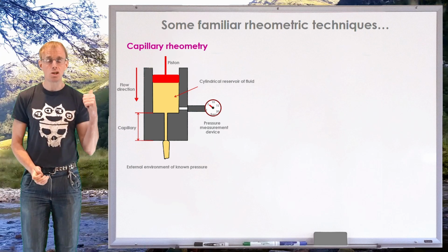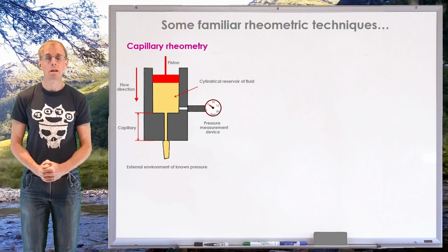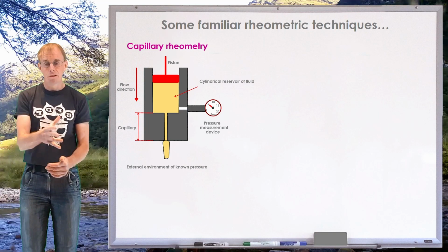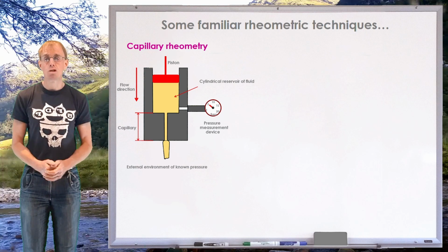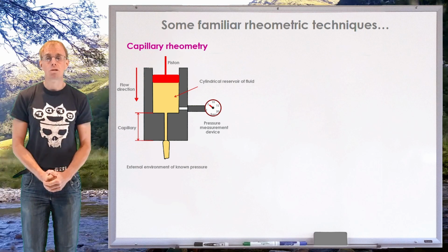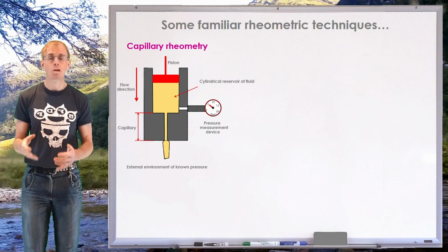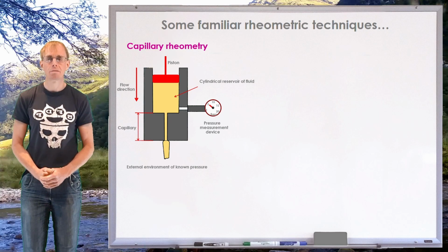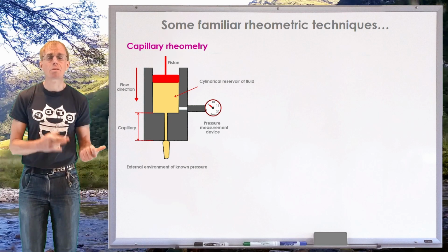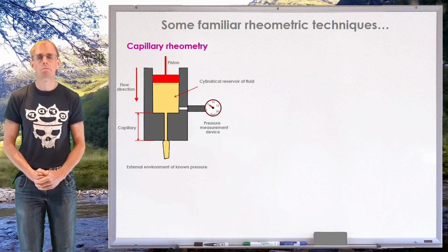Now, of course, we could actually put capillary rheometry in line with an extrusion line, couldn't we? We could have, for example, a side stream of polymer taken from that extrusion line through a known geometry with two melt transducers at either end of that geometry, such that we can measure what the pressure drop is across that known geometry and infer one viscosity value for that. So capillary rheometry you might find as some of the online monitoring tools that you can have for processing lines.